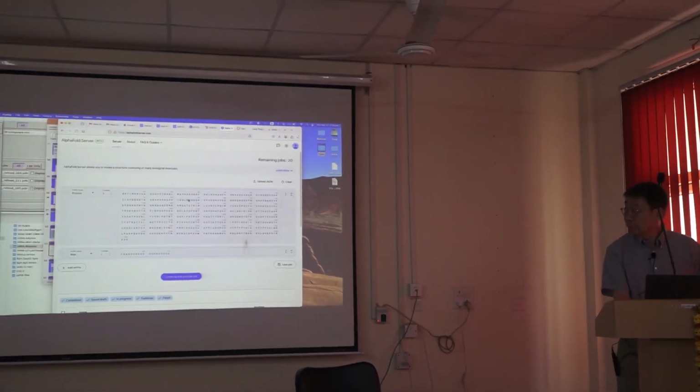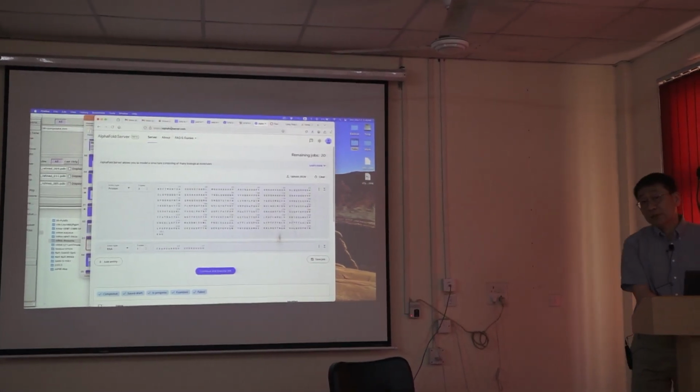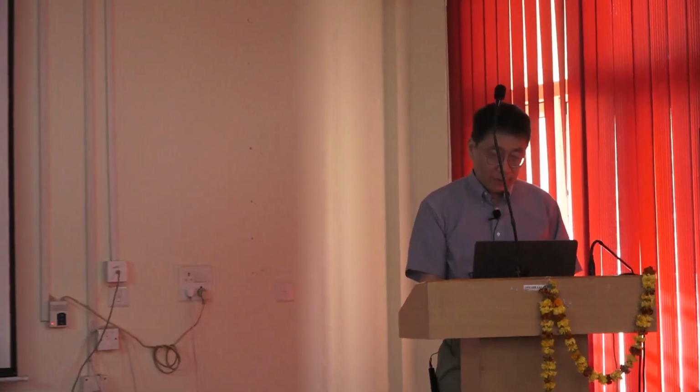So here's the AlphaFold server. Just Google it, you'll find it.